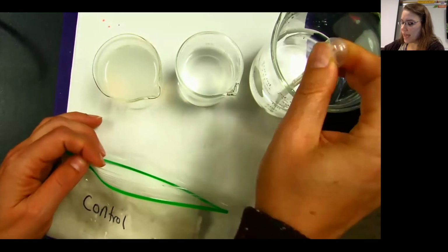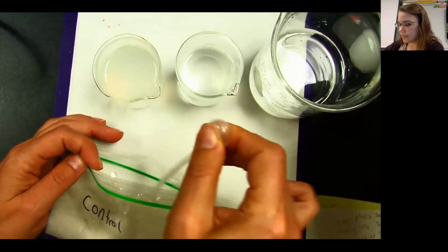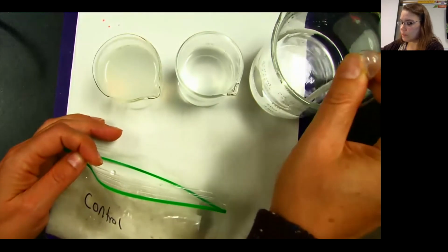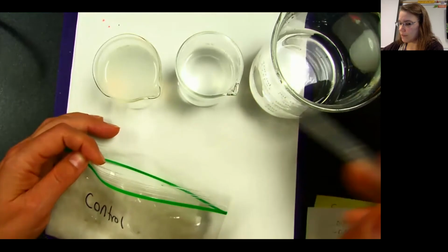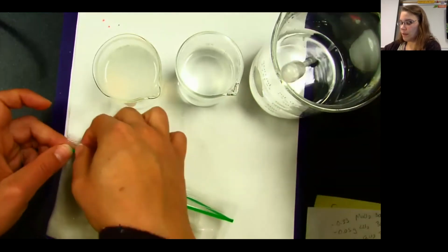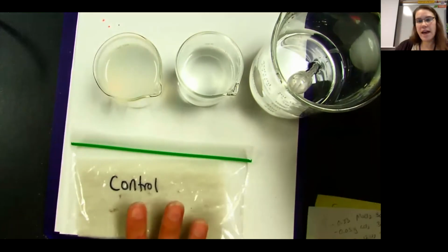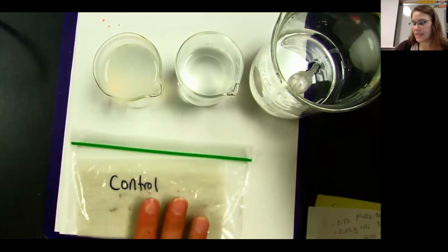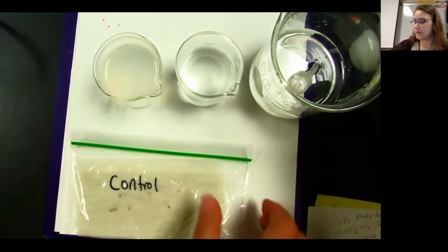If you don't have a bag, you just have like a Tupperware container or something like that, that's fine. Cover it with something so that it gets light inside. These guys are going to want some light. But seal it up so they don't dry out. So I have my control done. Now I'm going to do the same thing for each of the 8 different ones.